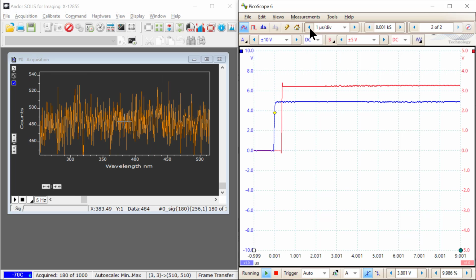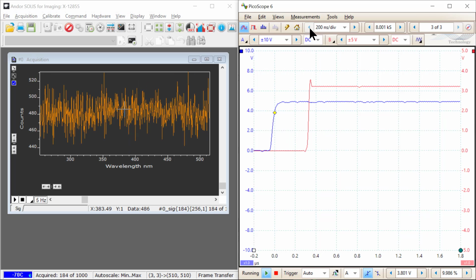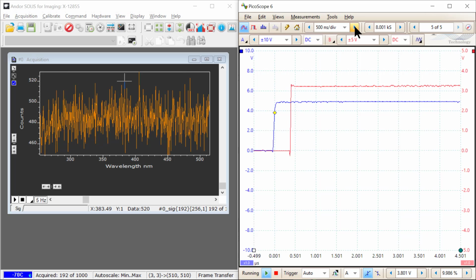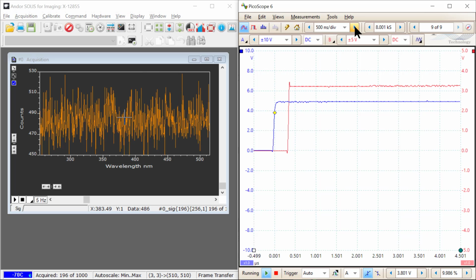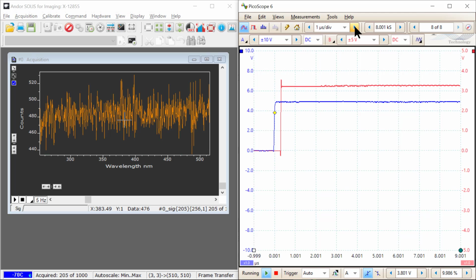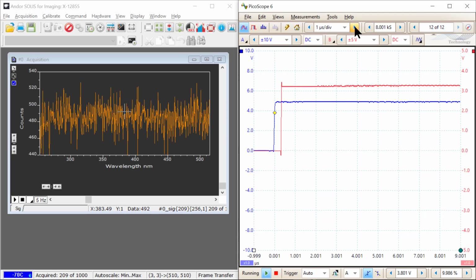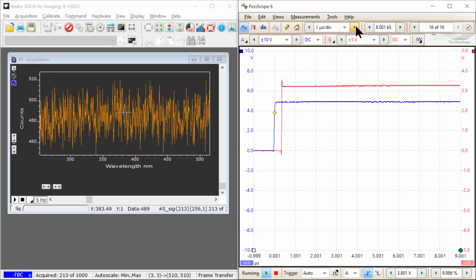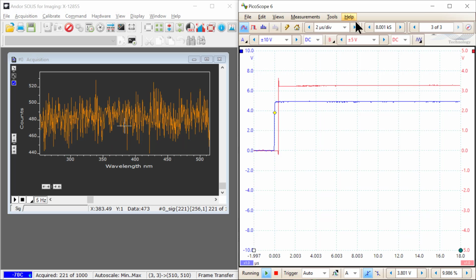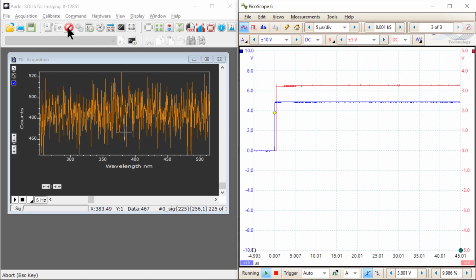It's on the order of, I think, on my measurement here, a couple hundred nanoseconds perhaps. But again, I'm not sure how much I trust that level of precision on this oscilloscope that cost me $100 or something like that. And I'm sorry, Picoscope guys, if the actual specs are better than that. I'm just saying I would use it as a little bit qualitative of a measurement there. So it's relatively prompt, at least compared to the first frame.